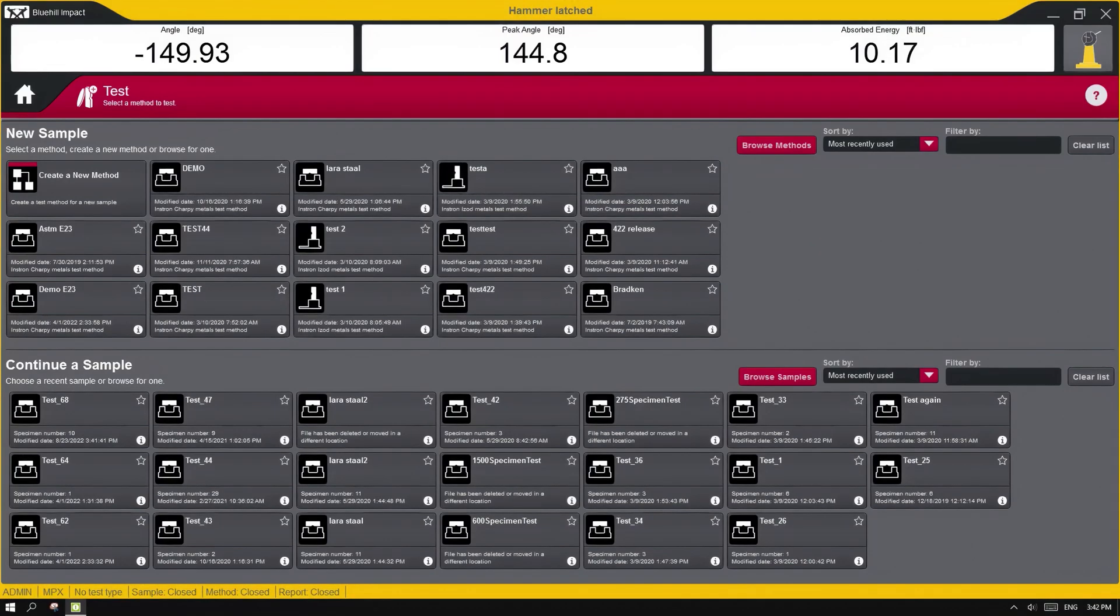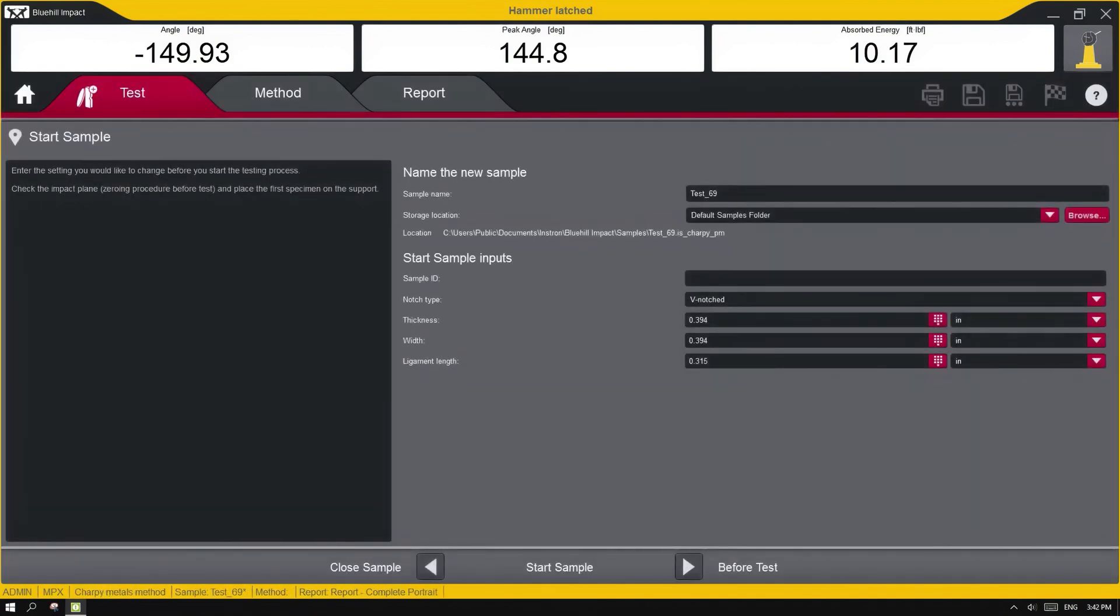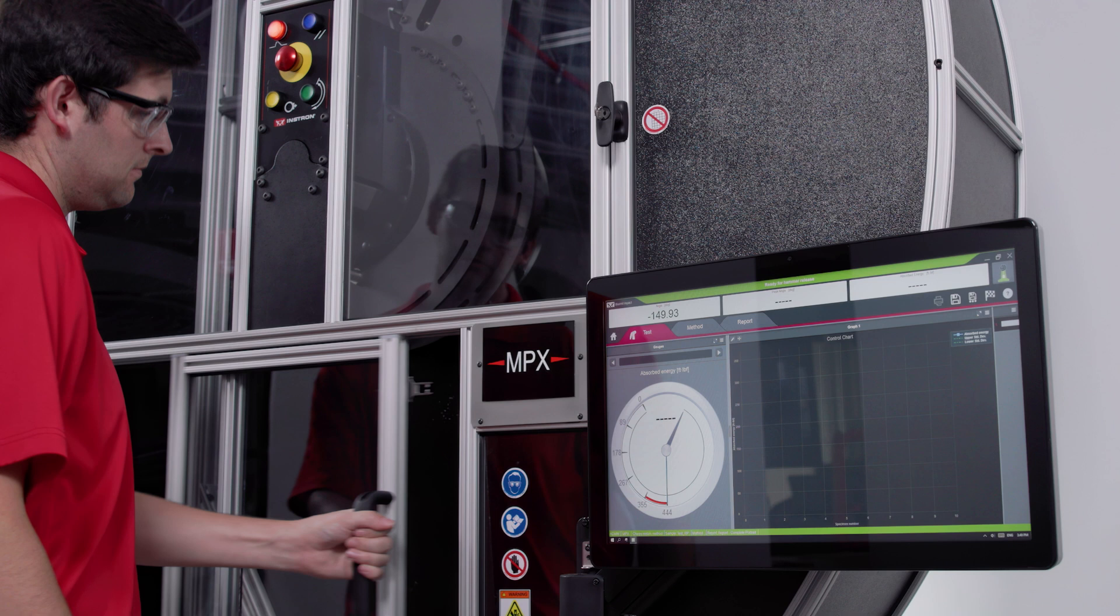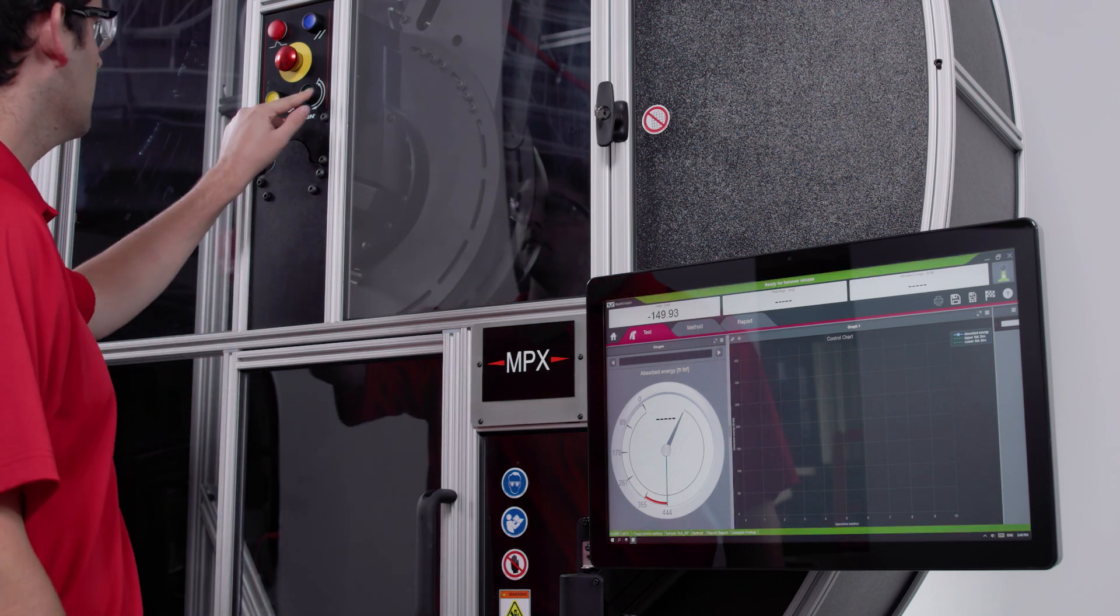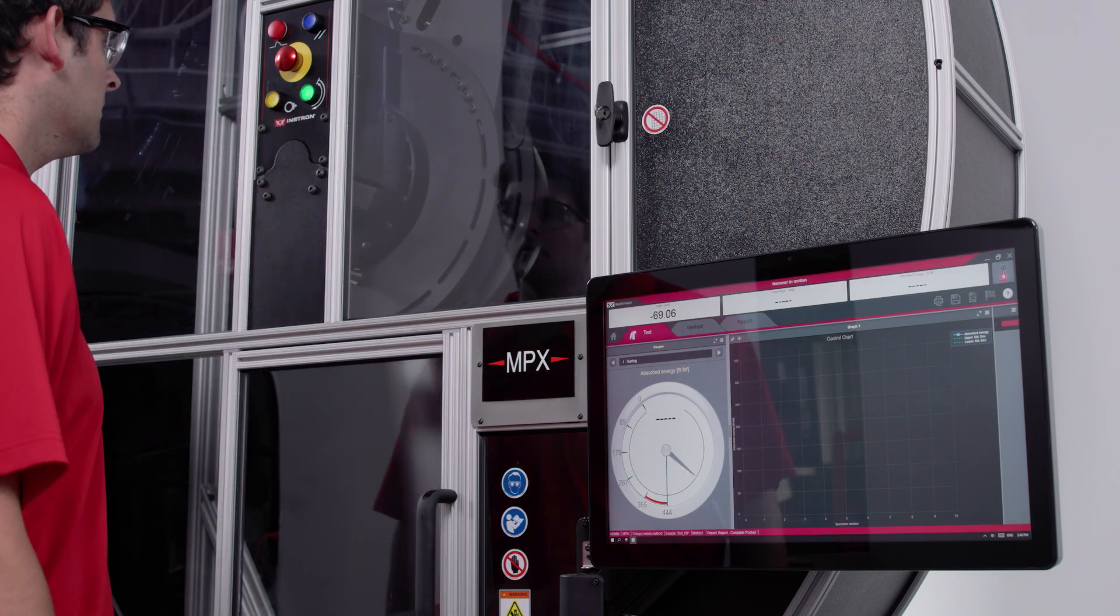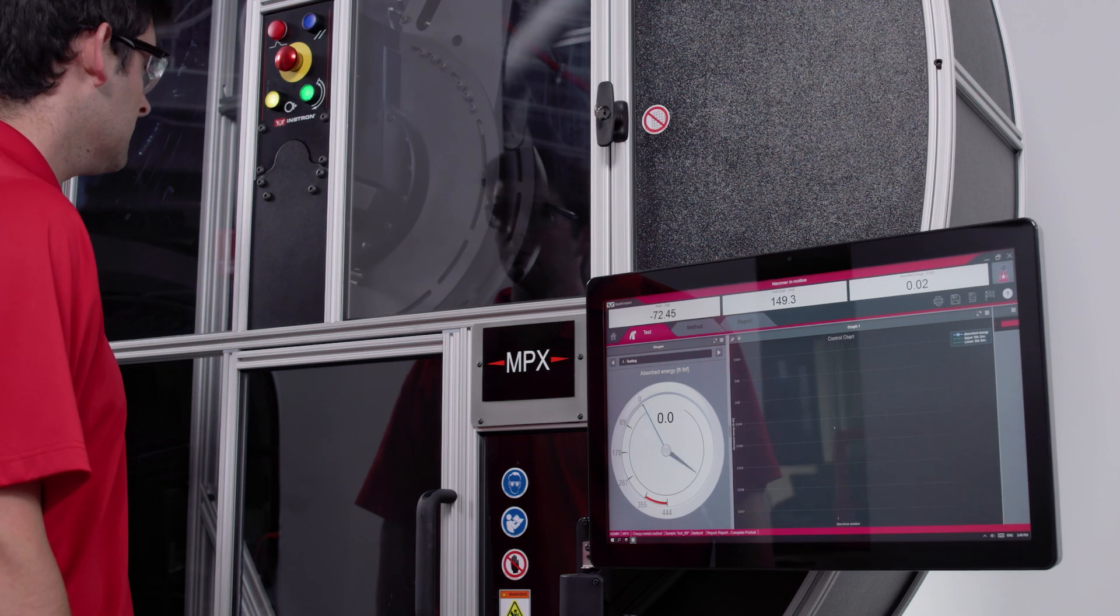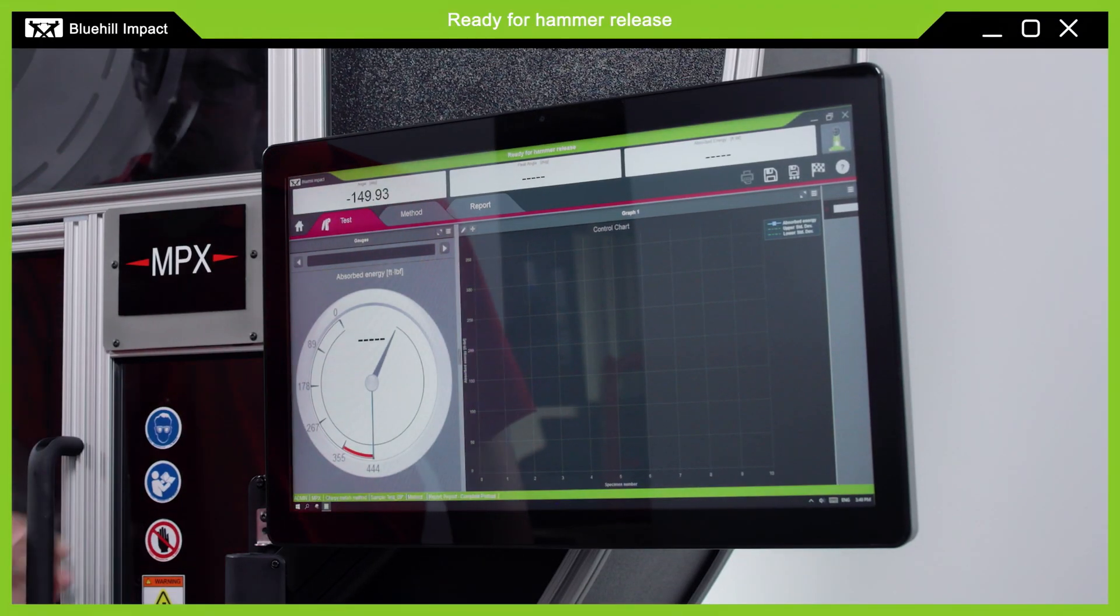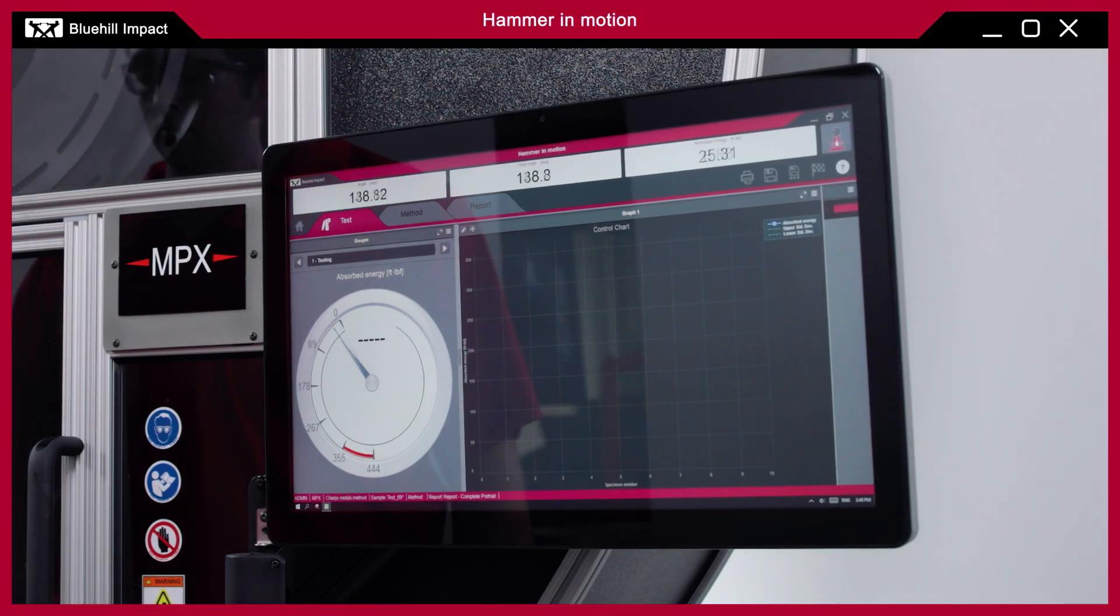The software includes pre-built methods for some of the most common Charpy and IZOD testing standards. Bluehill Impact also provides clear visual feedback regarding the system status as indicated by the changing border color around the software, making it easy to see when the system is in a safe setup mode and when a test is underway.